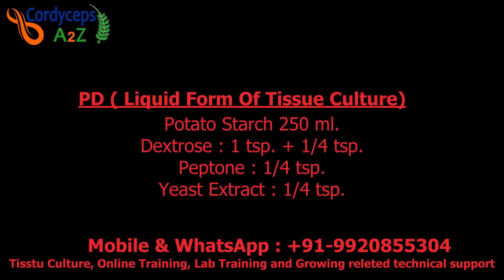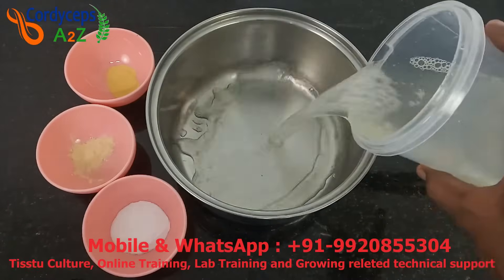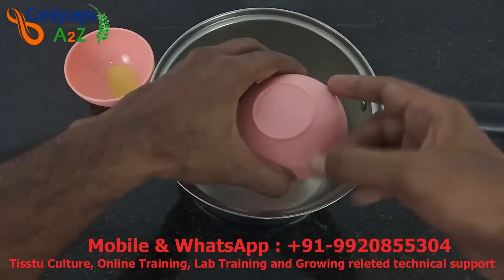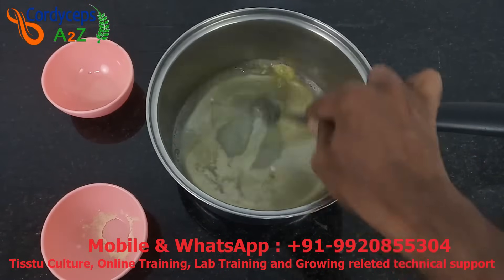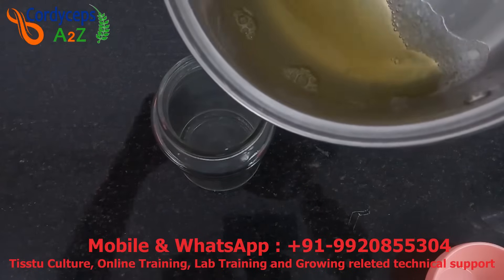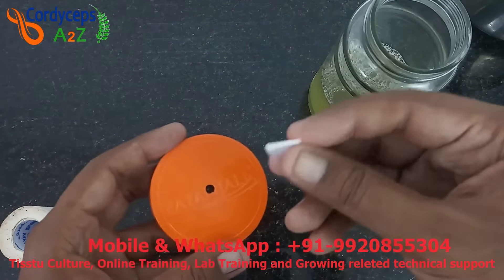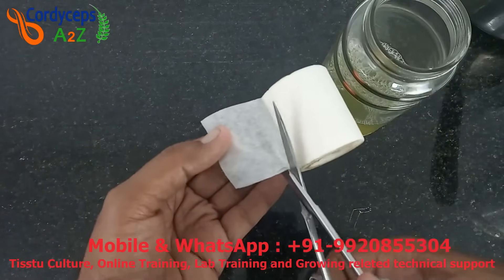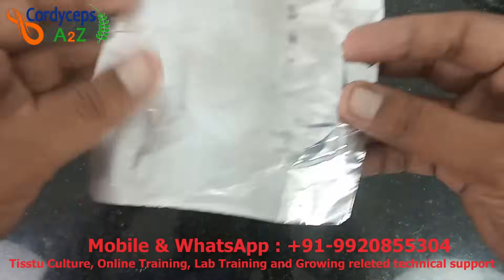Now we will make PD — Potato Dextrose — also called liquid tissue culture. To make PD, take 250 ml of potato starch, then add one teaspoon plus one-quarter teaspoon of dextrose, one-quarter teaspoon of peptone, and one-quarter teaspoon of yeast extract. Mix all ingredients well. I have taken a 700 ml glass bottle — you can also use a 500 ml conical flask. Transfer the liquid to the glass bottle, then make a hole of approximately 5 mm in the plastic cap and stick a piece of filter paper on it with tape. Fit this cap on the bottle and put aluminum foil over it.